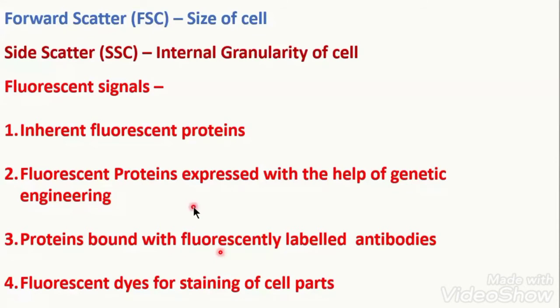experimentation which can be done by flow cytometry with your drugs. So whatever I am going to discuss now, different application, every time you keep in your mind, if you're working on a particular drug molecule, and then you can have a question in your mind that how I can utilize this technology, these parameters, to understand the effect of my drug or my herbal extract or my molecule of interest, how I can apply this. Then this lecture or this discussion will be very useful for you.